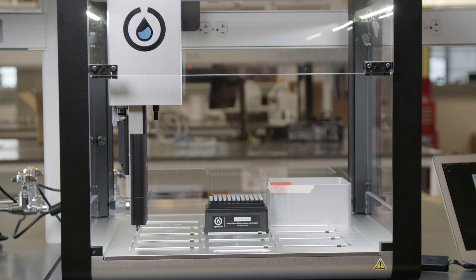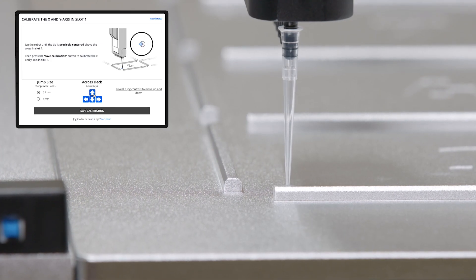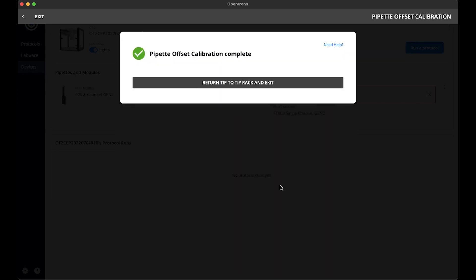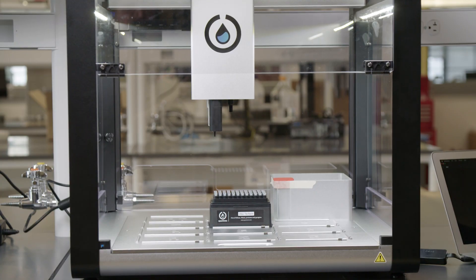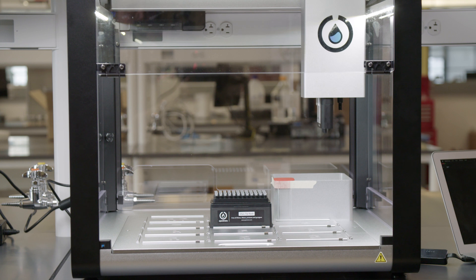Similar to the deck calibration, I will need to align the pipette so that the end of the tip is in the middle of the cross in slot 1. Mine is slightly off, so I will jog the pipette so that it is aligned. I align the pipette with the cross and can now save the calibration. When the check mark and a pipette offset complete message appears, the calibration is complete. I will have the pipette return the tip to the tip rack and continue to the other mount. The tip length calibration and pipette offset calibration are now complete for the P20 on the left mount.